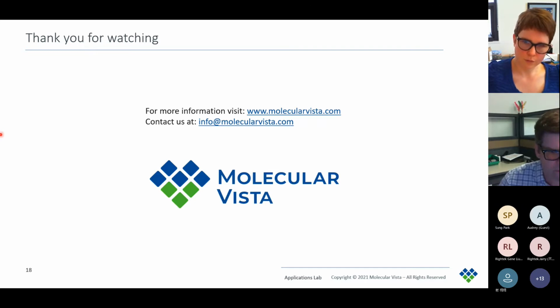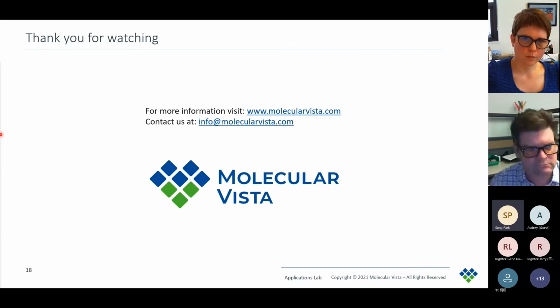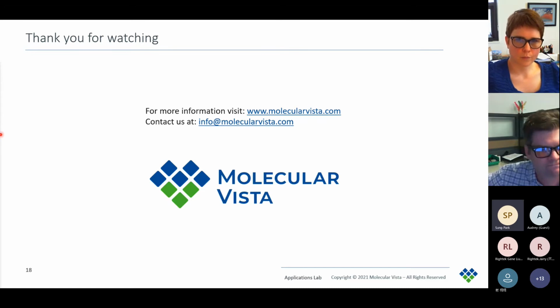Excellent. I think for those who are possibly casting the sample into a resin, when you microtome or ultratome such a sample, it might be prudent to do it at cryogenic temperature, because then the resin is hardened and the chances of resin spreading over the sample are lessened.